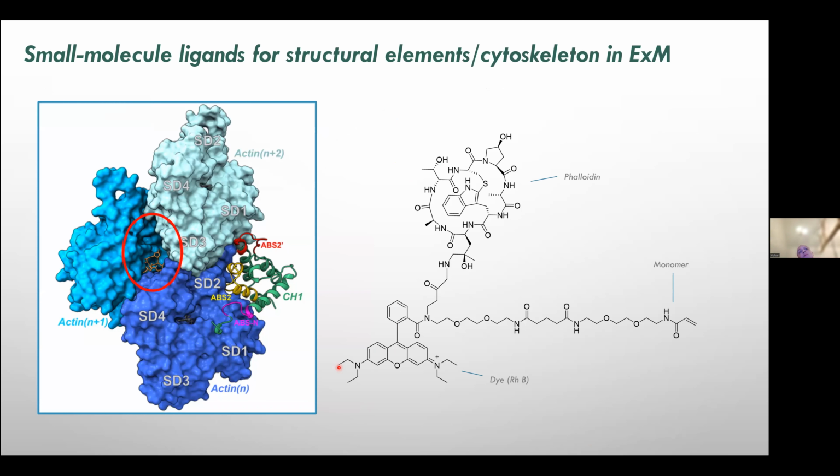So moving on from the standard immunofluorescence approaches and the antibody staining, we then sought to extend the biological information that we could address. And this started first with phalloidin staining for actin. The actin filament is actually built from monomers with clefts where phalloidin is a very strong binding ligand. And this is used by most commercial phalloidin stains for actin. There are a few other ligands, but they're not used as widely.